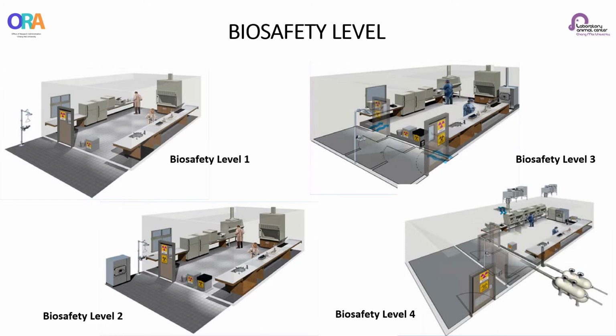The primary route of exposure to personnel working with these types of biological agents and toxins relates to accidental exposure via the cutaneous or mucosal route and inhalation of potentially infectious aerosols. All procedures involving the manipulation of infectious material are conducted within the BSC or other primary containment device. No work with open vessels is conducted on the bench.